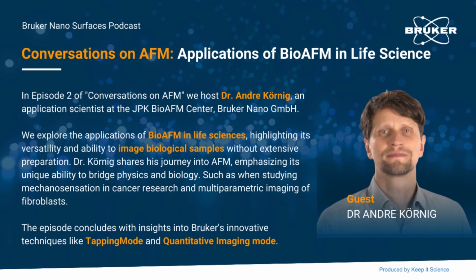For people who don't know so much, and sometimes want to change parameters, these are easy to understand compared to some other AFM parameters, where you have feedbacks and so on, which are more complicated to understand. With this one, it's quite easy to use. So it's easy and powerful. What else do you want? Absolutely. The easiest and the most powerful thing for scientists is good. Exactly.